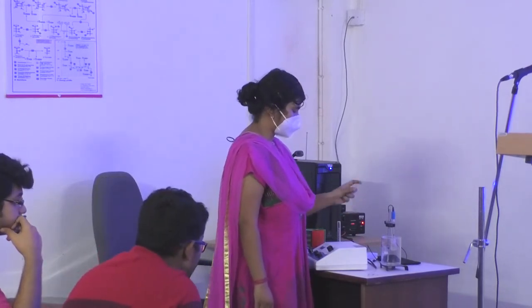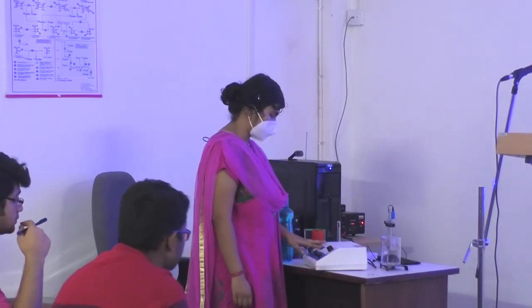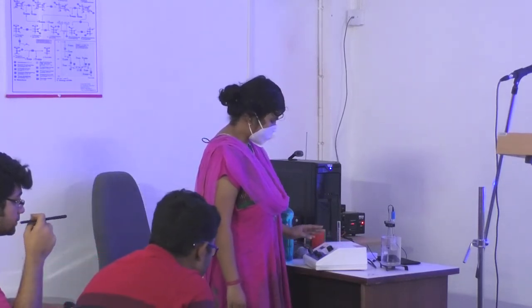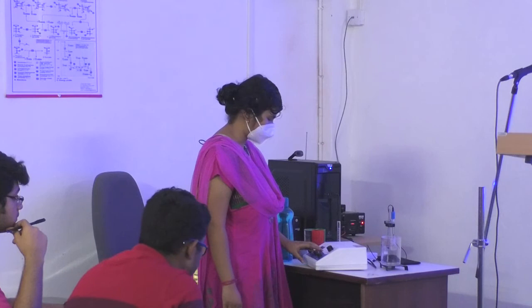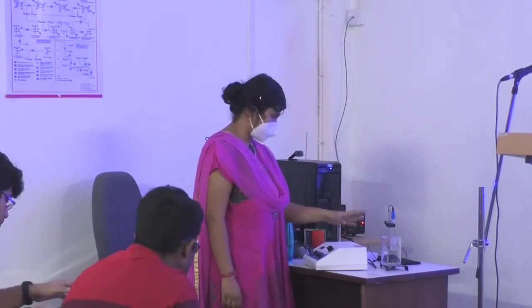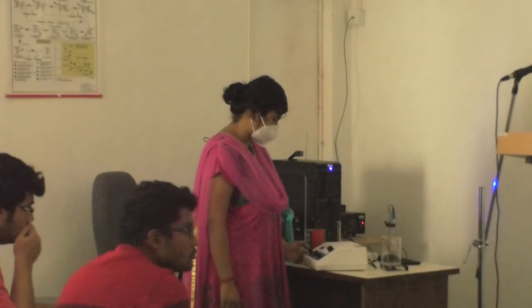First, the glass electrode is dipped in the acidic buffer. After switching on, the function knob has to be set at the pH mark, and the temperature also has to be kept at room temperature. Then we will get the pH of the solution in which the glass electrode has been dipped, and we will adjust it using the slope knob.